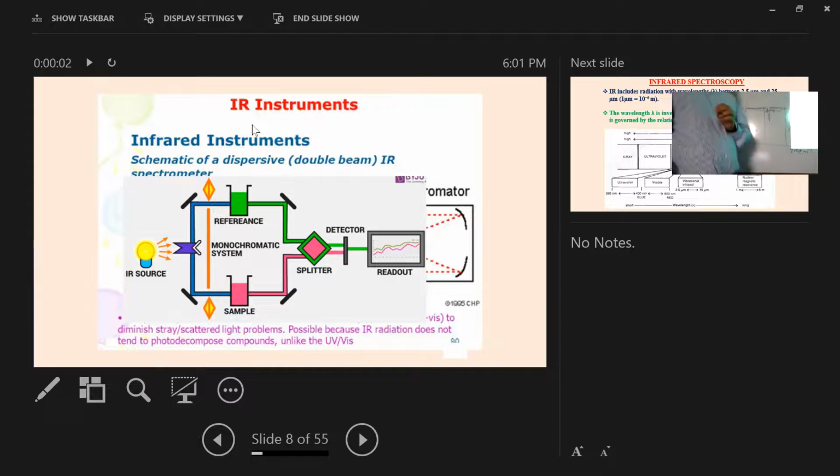That is the noise. Therefore, if the noise is very high and comparable with the signal, that type of instrument is of very bad quality. That means if our noise is like this or maybe like this, then it is very difficult to tell which one is our expected signal and which is the noise. Therefore, we should avoid that type of instrument.